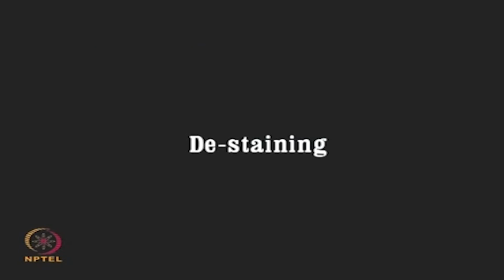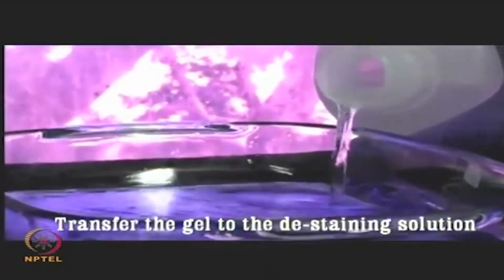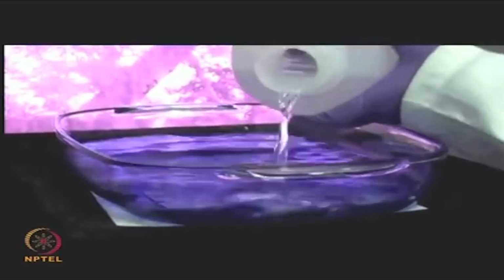Destaining. Drain out the staining solution from the tray and pour the destaining solution consisting of methanol and acetic acid into the tray. Place the tray on the shaker for around 6 to 8 hours until the background stain of the gel is completely removed and the spots are clearly visible.